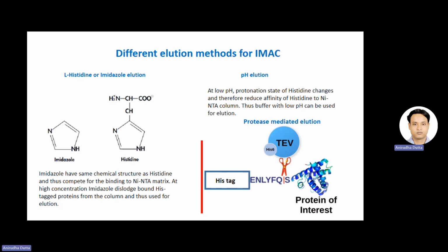It will not chop down our protein of interest. It will cut just the connection between the histag and the protein. So suppose now the protein with histag is bound to the matrix. So this red bead, think about this is the matrix, and this is the histag, and this is the connection between the histag and the protein, which contains the recognition site for that particular protease.